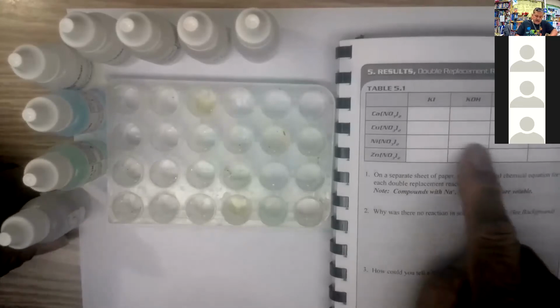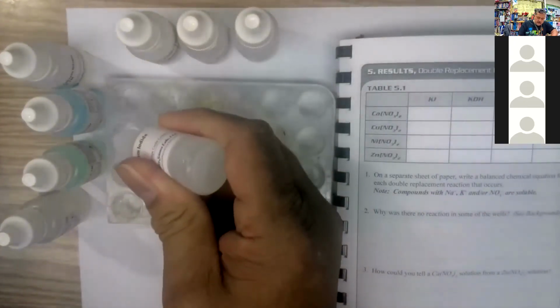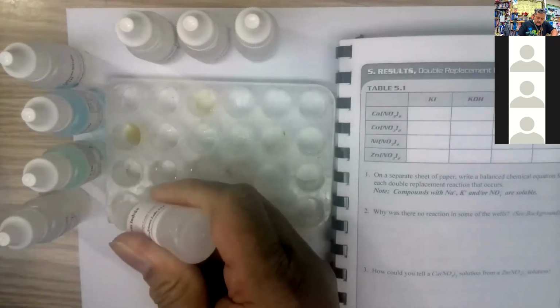Now, first we're going to do the potassium iodide going down like that. There's the potassium iodide. Going to put drops in going that way. Okay. We go 3 drops in each of the 4 wells.